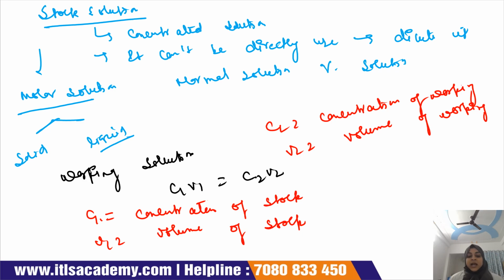Okay, so this is how we calculate working solution with the help of the stock solution, and how we calculate the stock solution is already discussed.